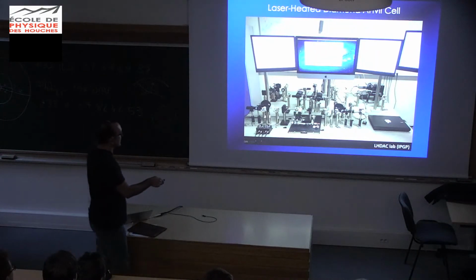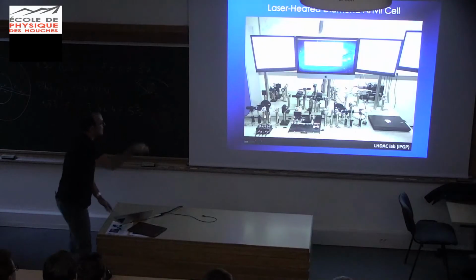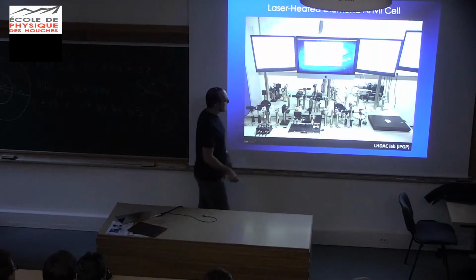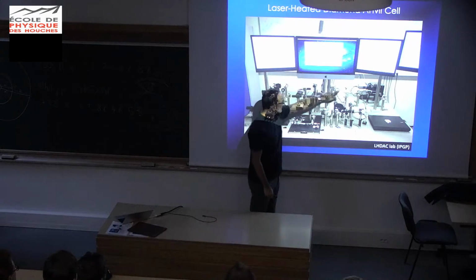That's the diamond cell that you recognize here. So that picture was taken from here, with the light coming out this way. I'm not going to describe this at length because there is a ton of optical components, but basically this is the laser.